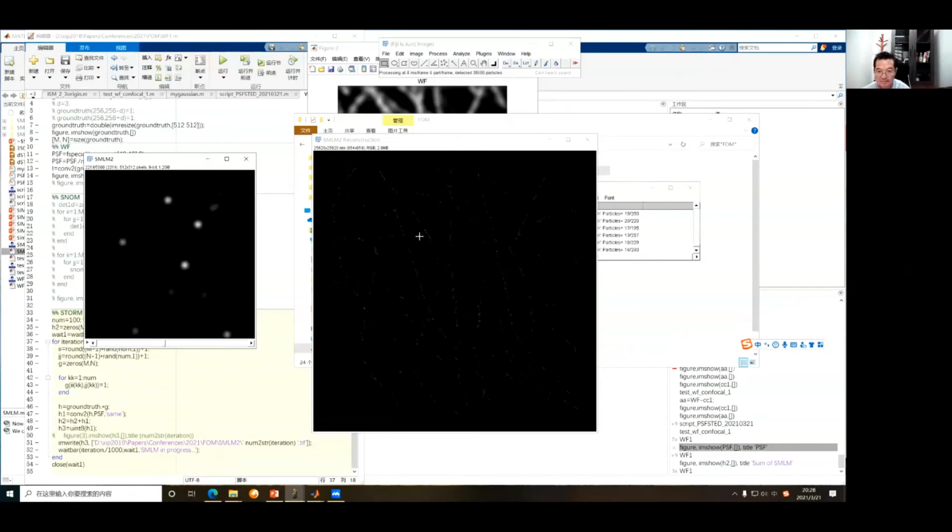And of course, if you're interested, you can look at other types of data to demonstrate the field, as well as single molecule localization here using the same technique. All you need to change is ground truth equals to read a different file. We're almost there. Okay, a huge map. I won't save it. So yeah, I have done a different demonstration of that.